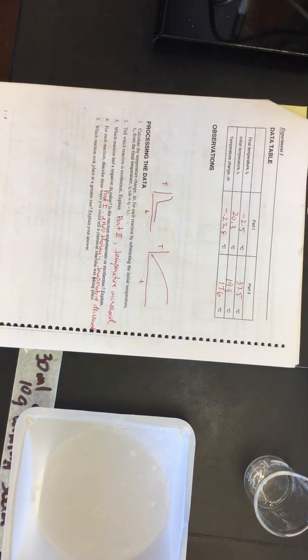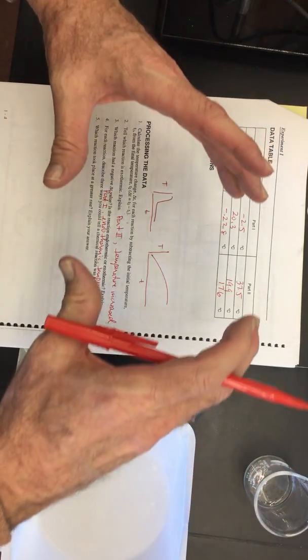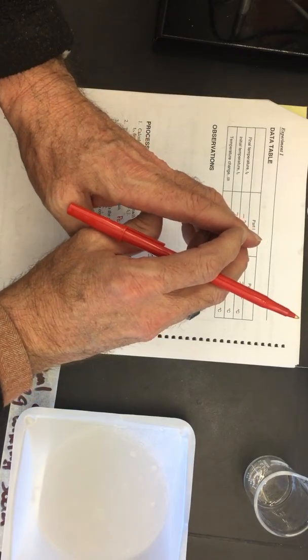It gets colder. It actually pulls the heat from the surrounding environment into the chemical reaction, and therefore it makes the surrounding area cooler since it pulled the heat to make that reaction take place.